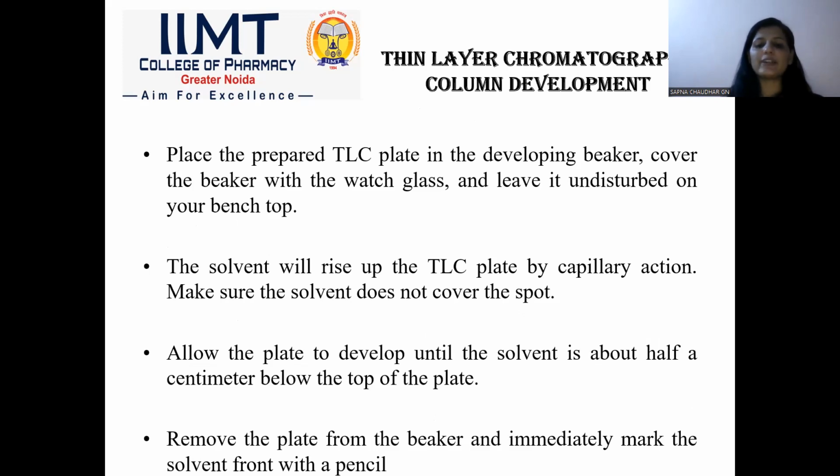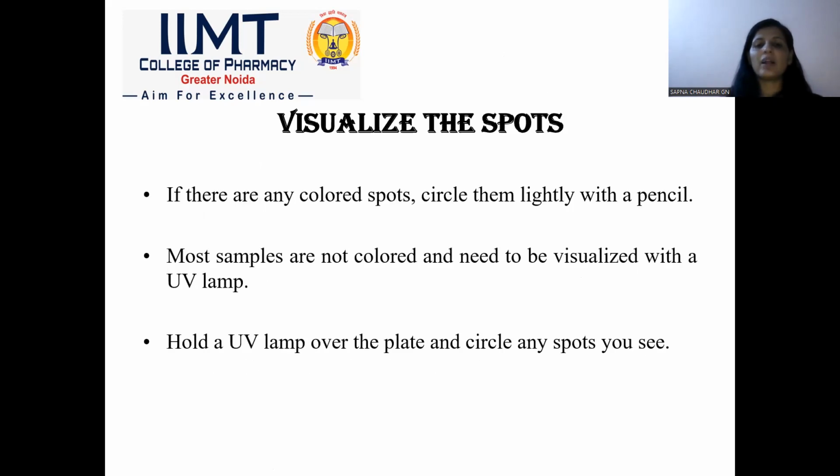Allow the plate to develop until the solvent is about half a centimeter below the top of the plate. Then remove the plate from the beaker and immediately mark the solvent front with a pencil. The last step is to visualize the spots.